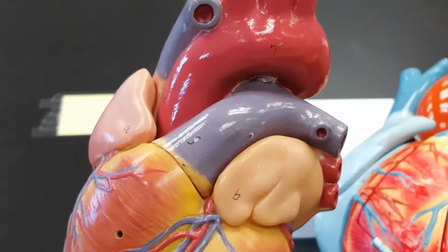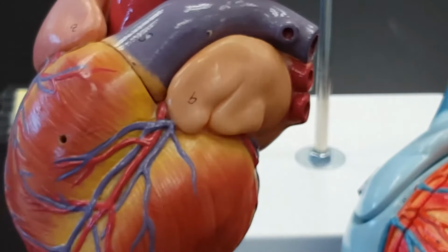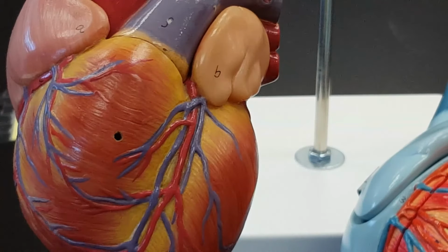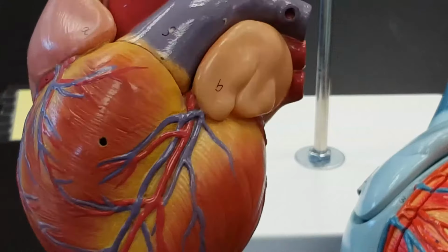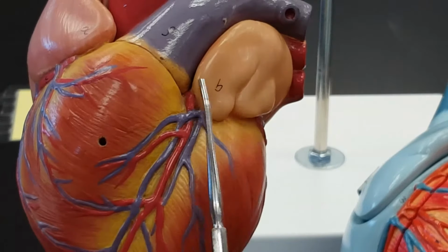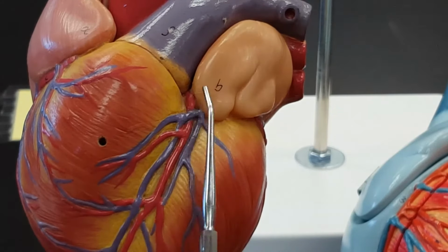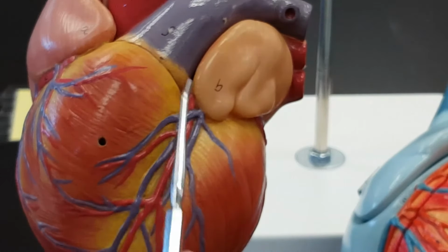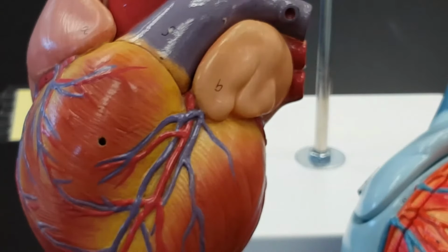First, I'm going to show you the limitation we have for the left coronary artery. This is the left side of the heart. This is the right side of the heart. The left coronary artery usually is found nestled right under this flappy structure called an auricle, and on this model I can't really distinguish it at all. I'm going to say that again. On this model I can't really see the left coronary artery at all, at least not worth anything.